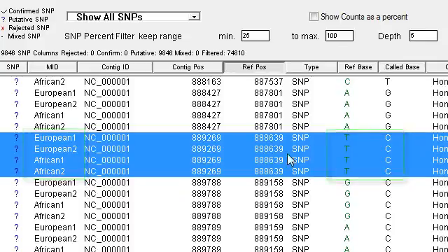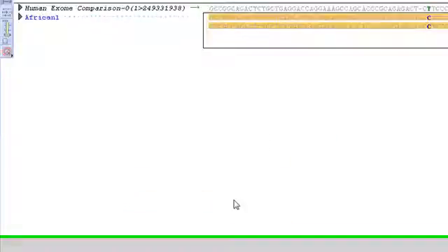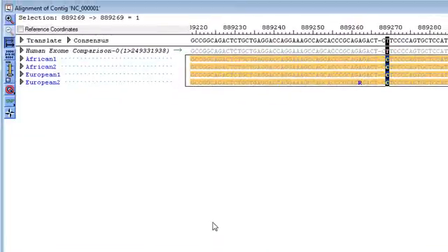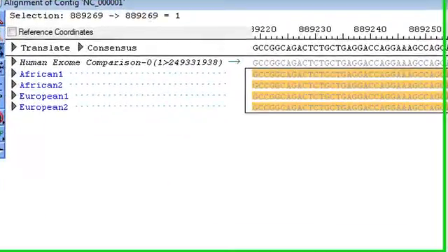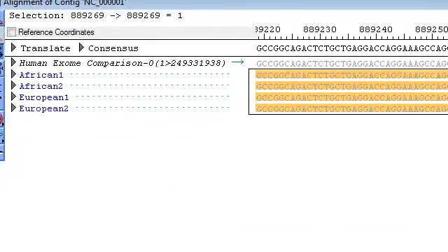Now, if I double-click on one of these rows, that will take me to that position in the alignment view, and then I can see that SNP within the context of each exome by expanding any of these samples.